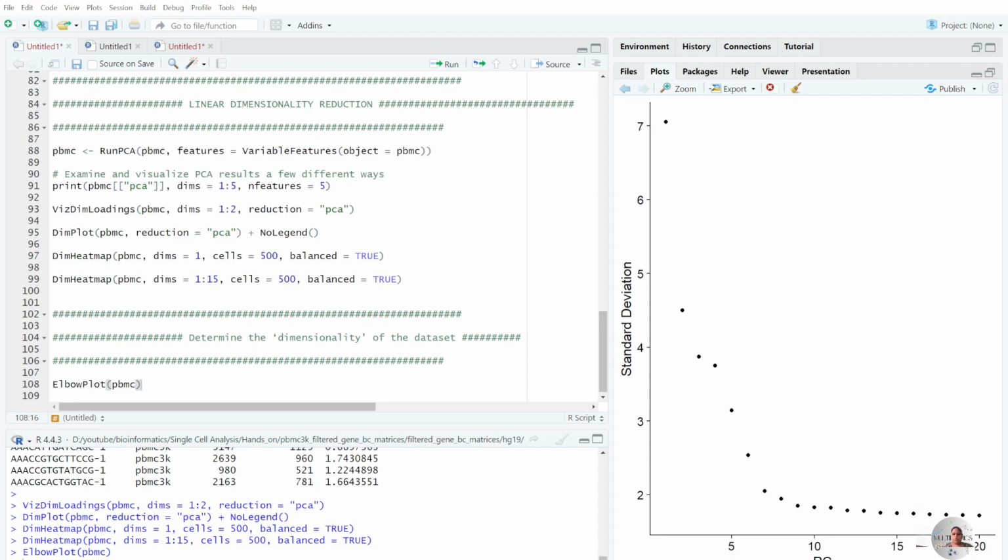So look for the elbow point. The elbow point is a point where the line starts to flatten. So flattening is still here, right? So here we can tell how many dimensions we are taking. Even here we can see some curves. So the flattening starts at almost the 10th principal component. So that is why it is helping us to determine what dimensions we can proceed with. So by interpreting this elbow plot, we are deciding that we'll go for the first 10 principal components. We'll have a dimensionality of 10. Now we have a reduced dimensional data, and we'll be proceeding further.